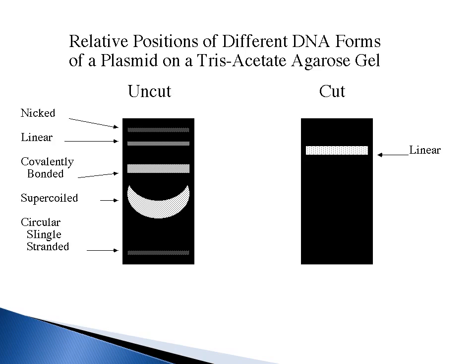Covalently bonded, you may see, although you don't commonly see that on a gel, you're going to see usually your brightest, most intense band, and usually the furthest down that you see is supercoiled. And sometimes you could see a lower band that's a circular, single-stranded plasmid, but you don't always see that band as well.